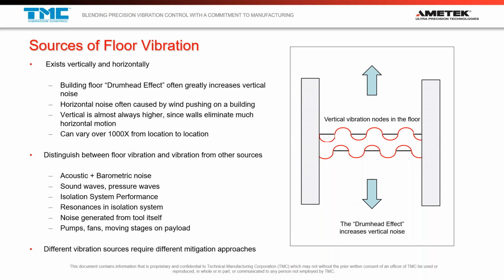Another factor is that it exists in 6 degrees of freedom, horizontally and vertically. So we're not talking about guitar strings here necessarily, and we're not talking about one-dimensional vibration. We're talking about a floor with standing waves on it that, if you could look closely enough, might almost look like raindrops are falling on it. You've got rings and nodes and all these interferences and funny shapes that are always happening in the floor. And this is due to all the natural resonant frequencies that might be in the floor.